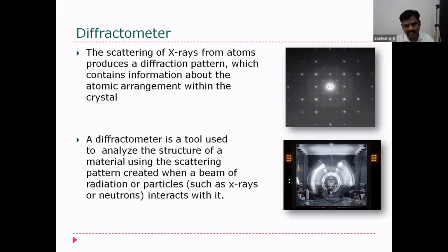If we are considering a crystal as a regular arrangement, then it should diffract, because the atomic planes should act as diffracting planes. And the second question is, are X-rays waves or particles? There was a larger discussion about it. If X-ray is behaving like a wave, it should get diffracted through a crystal. So both these questions should be answered.